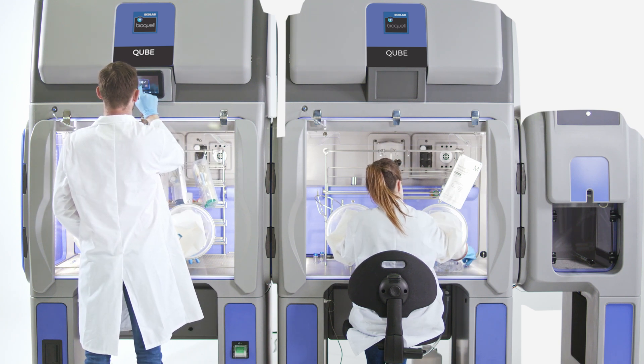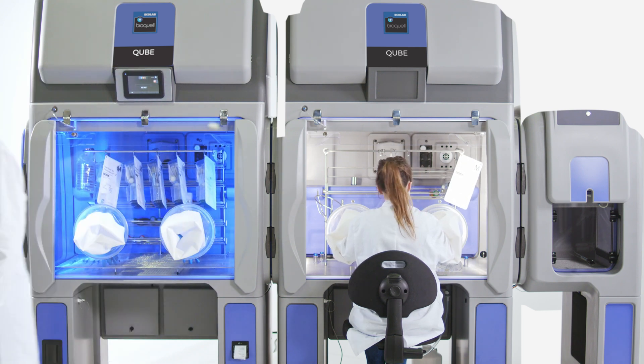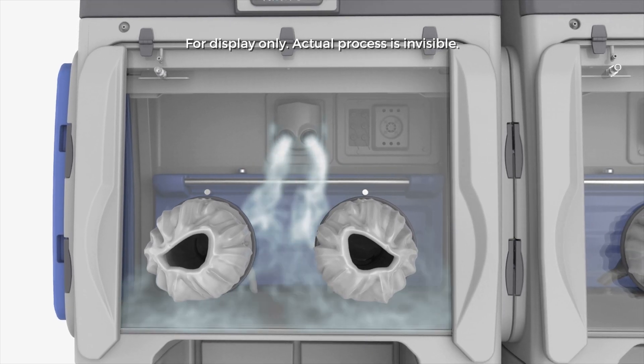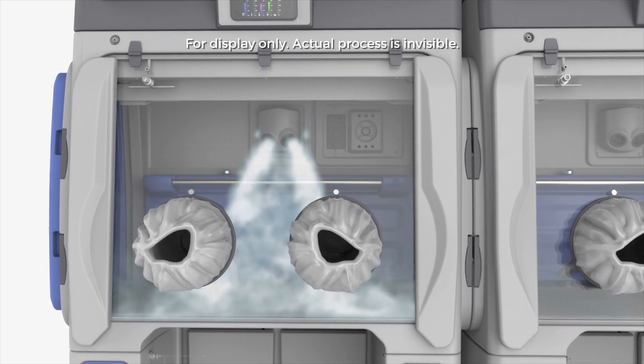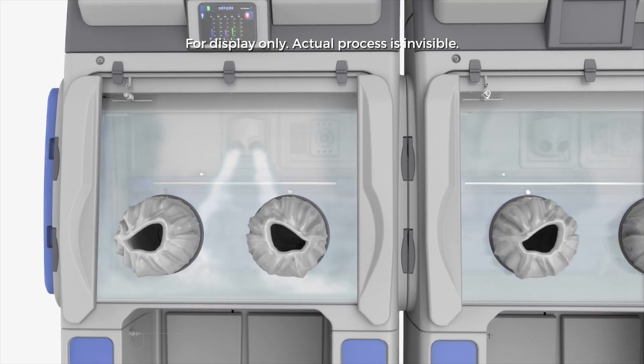If hazardous materials are being used, there is an option for external venting. Within the BioQuell Cube, a fully aseptic environment is created using BioQuell's integrated decontamination technology, our residue-free 35% hydrogen peroxide vapor.